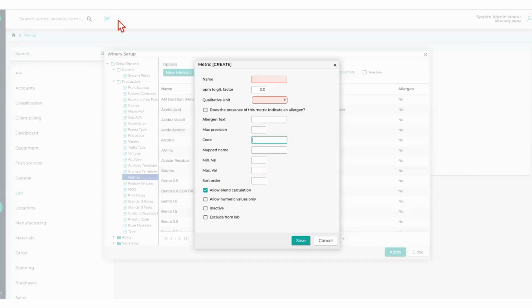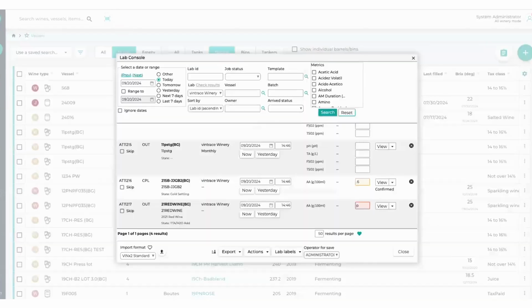Do you need to do anything about it? I can show you an example that you would see. So you can see it did highlight orange here. I'll erase this, how about? So if I did 0.5, click off, all good. And then the second you go above that 0.5, you will get the orange, but you can confirm.